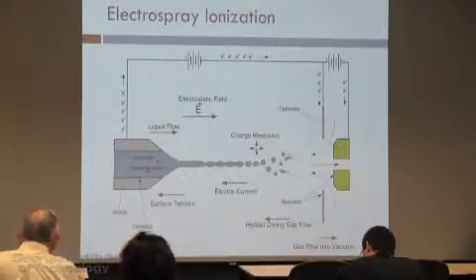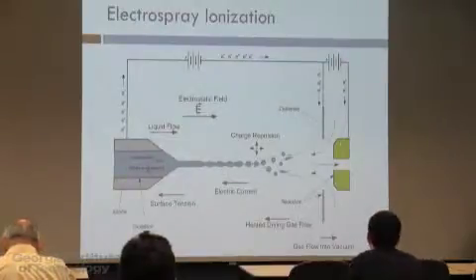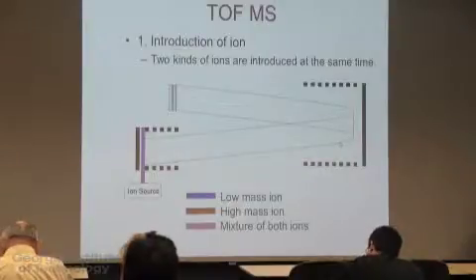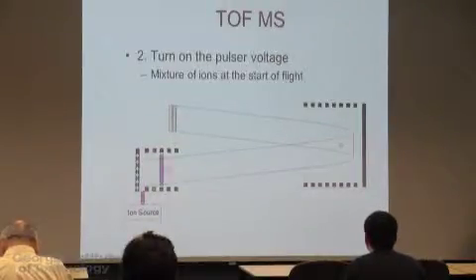And you can make ions by flowing your liquid coming from your chromatographic column and applying a potential, charging the droplets, very high voltage, okay? And that makes ions. Those ions go into a separator. In this case, we use a time of flight, and time of flight is one of the most elegant techniques for mass spectrometry. The way that it works is that if you start with a mix, let's say that we're all ions, okay? We're all holding a charge, we're all ions, and we need to be separated.